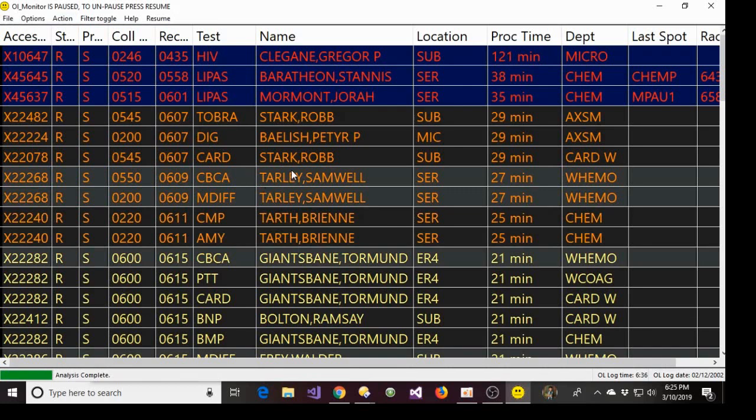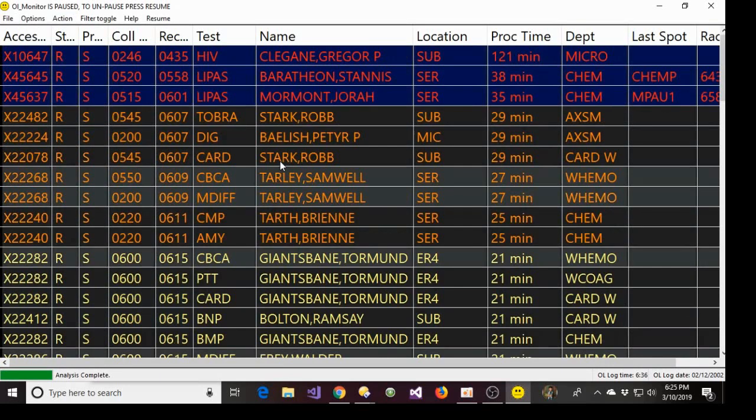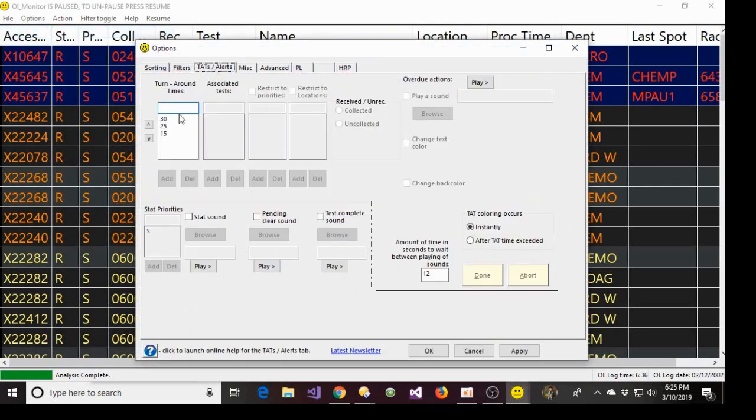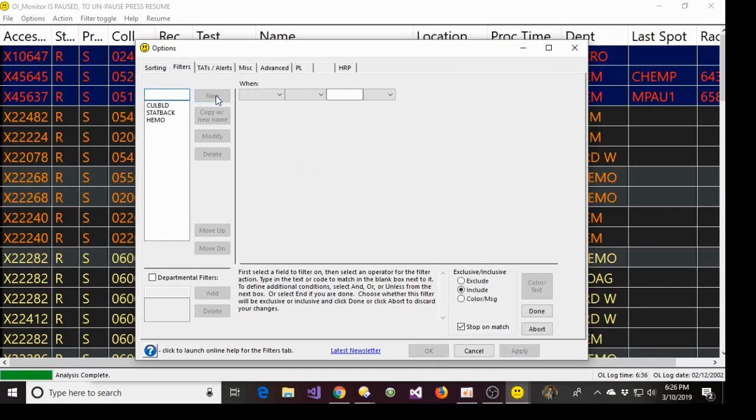All right, see, now all your hemo stuff is a little bit lighter gray, and it breaks up the list and makes things more visible. Okay, so we've got our turnaround time set at, what do we have our turnaround time set at? 15, 25, and 30. Let's say our turnaround time for hemo is 20 minutes, so we want to let them know before 25 minutes hits about those hemo tests getting close to being overdue.